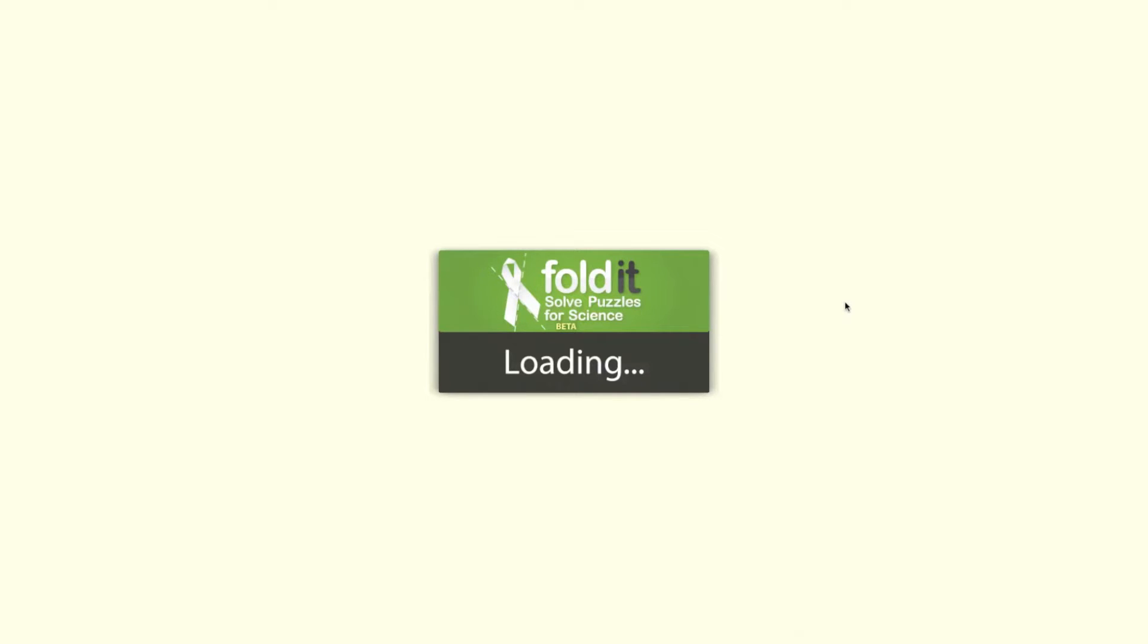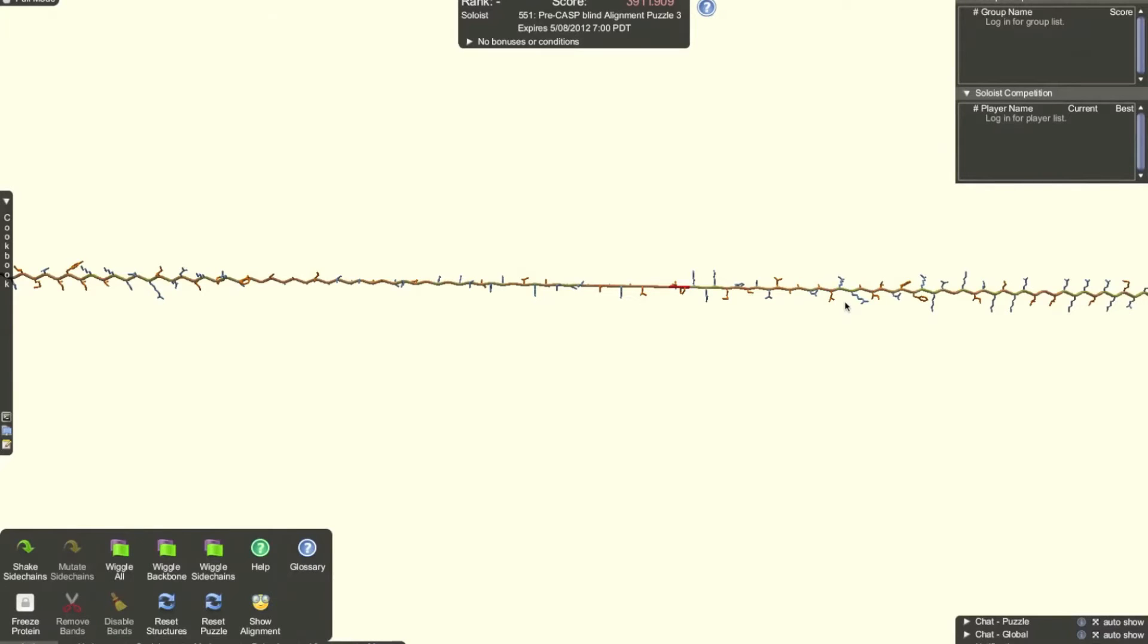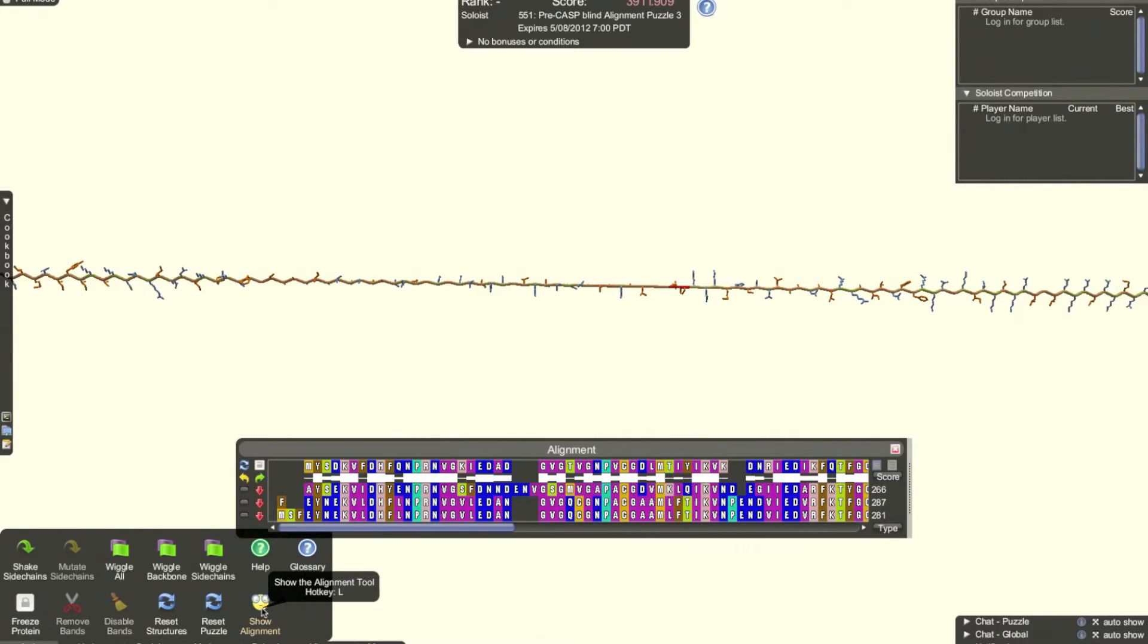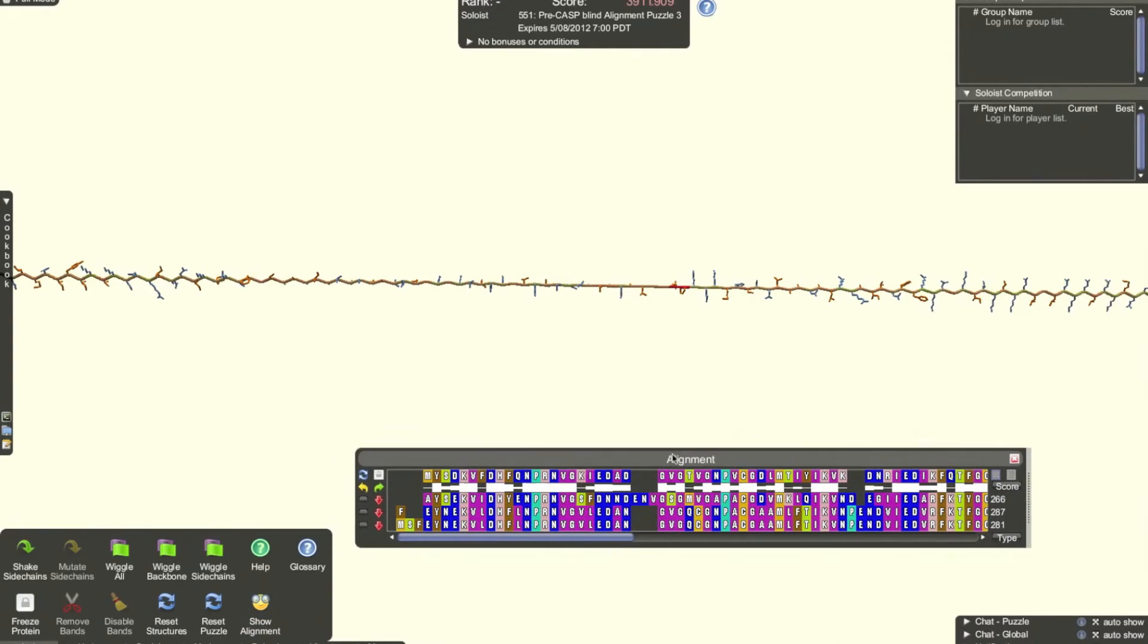First, I'll go through some background in the concept behind the alignment tool, and then I'll explain how to use the tool to make custom alignments, and finally, I'll explain how to use the tool to thread a protein.